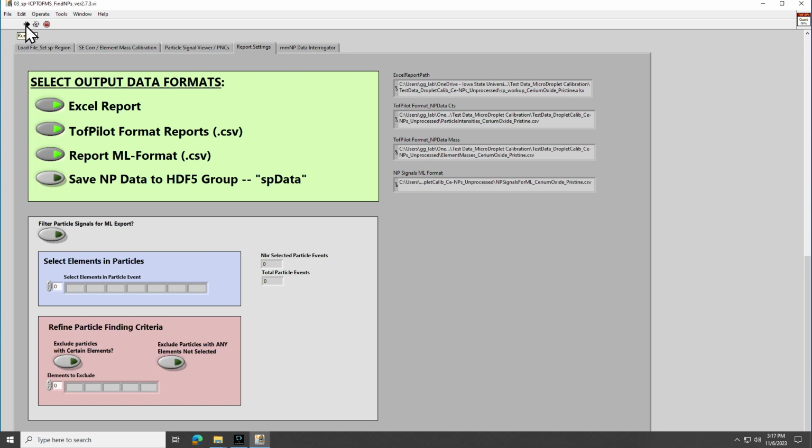When the program is finished, export data. Exported data will be written into the same folder where the sample S5 files originate.